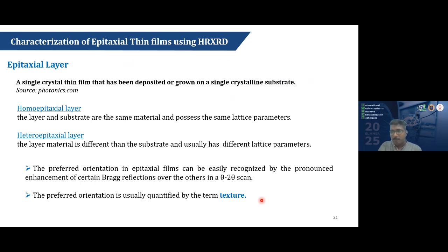That means there will be some preferred orientation in our sample. And the degree of preferred orientation depends on what percentage of the crystallites have that preferred orientation.